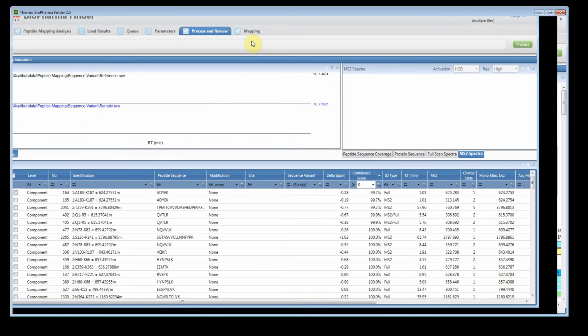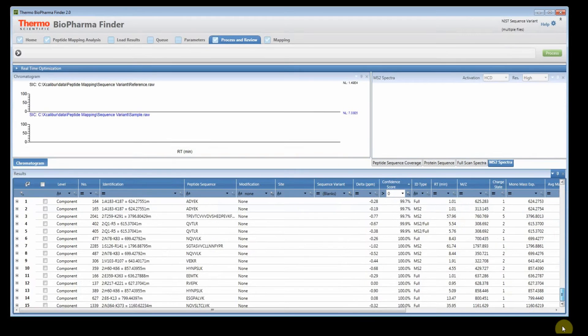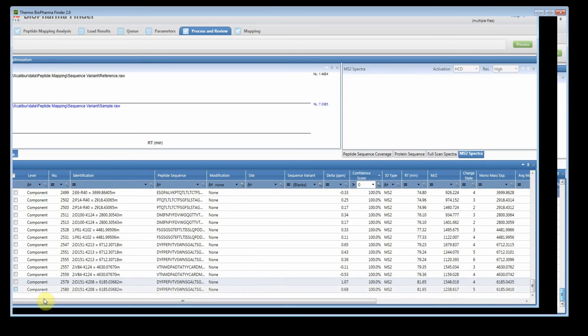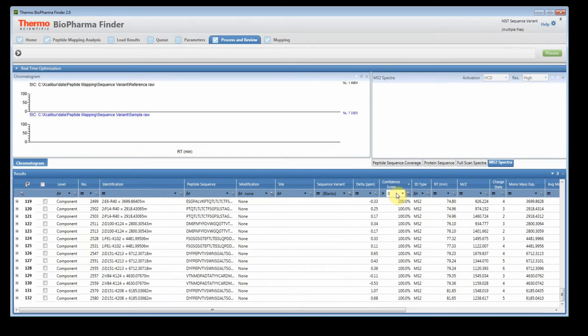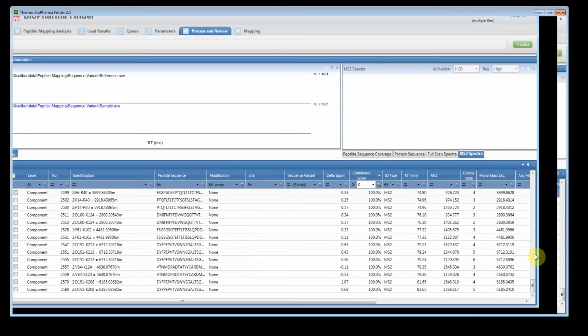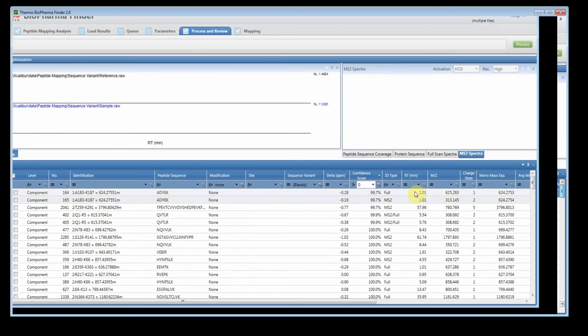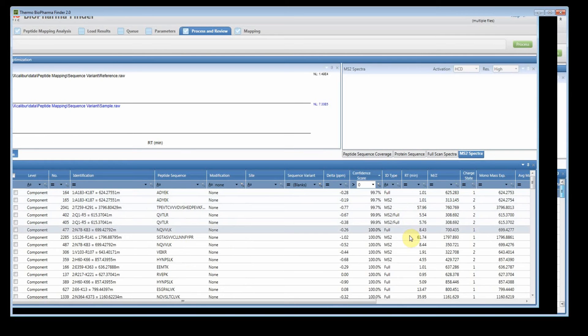So let's go back to the coverage map, or the processing review. It still has our filters, and now this time we're going to select 132. So remember, we've filtered away confidence scores that were equal to 0, which would be all the full scan data, and now we're looking at data that only contains MSMS.